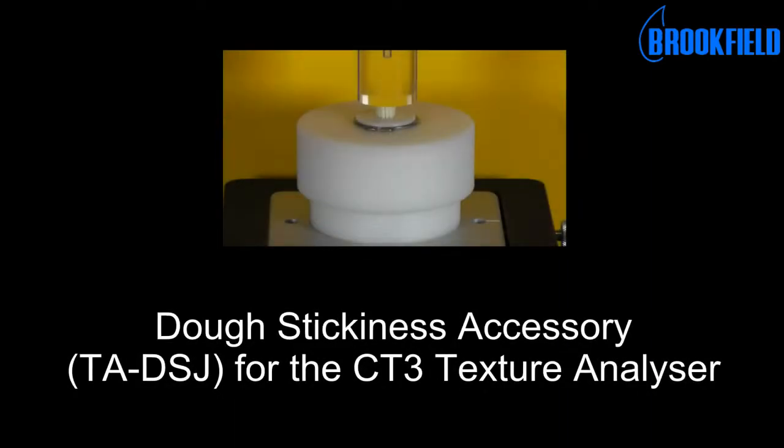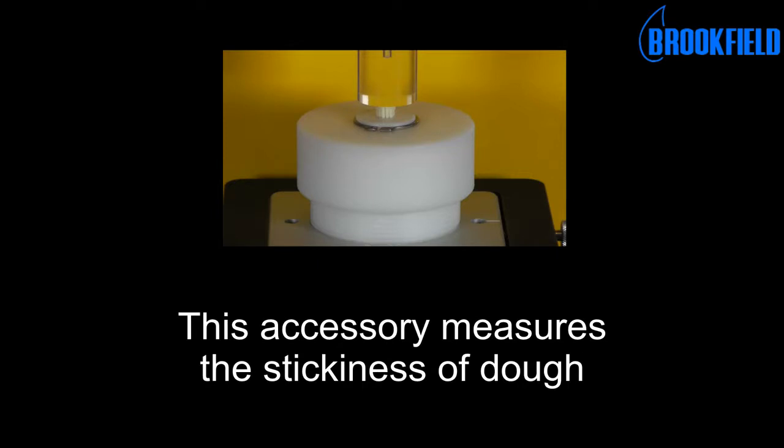This is the dough stickiness accessory for the CT3 texture analyzer. This accessory measures the stickiness of dough.